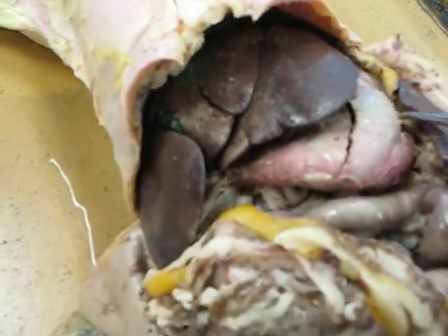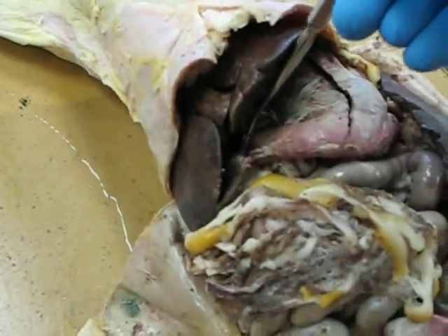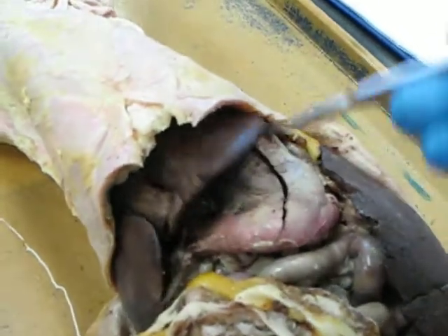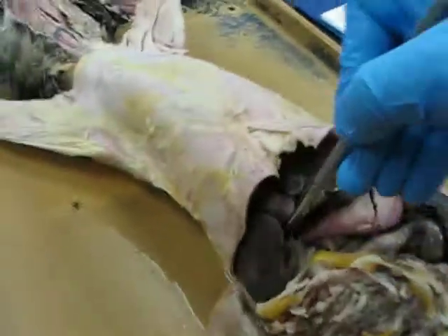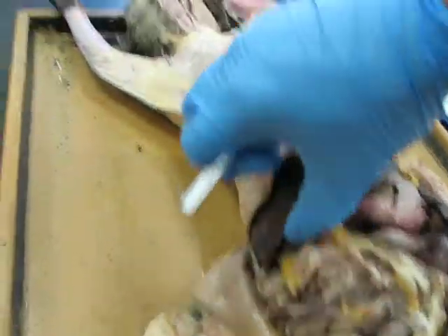Greater curvature. Inside we have the lesser curvature. And this is the pyloric sphincter, where the pylorus of the stomach joins with the small intestines. We have the body of the stomach, and inside there are folds. Those are called rugae.